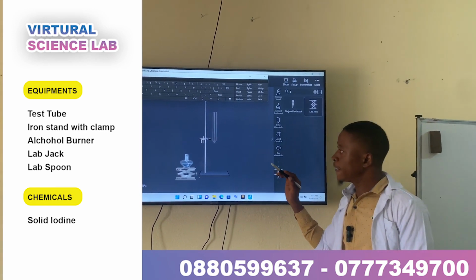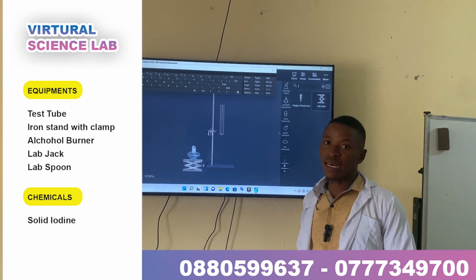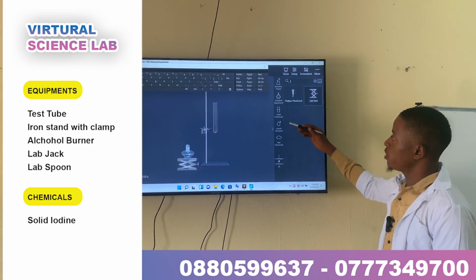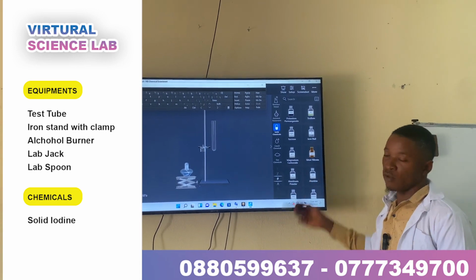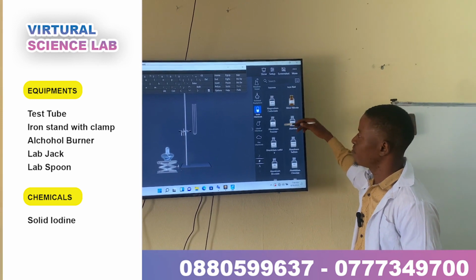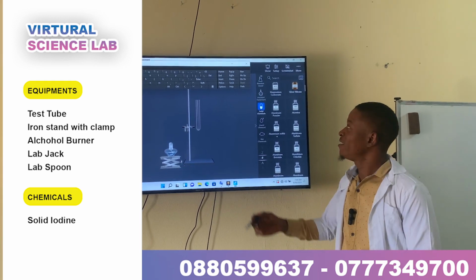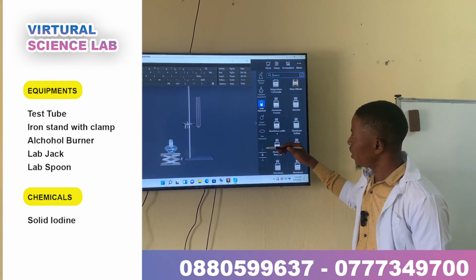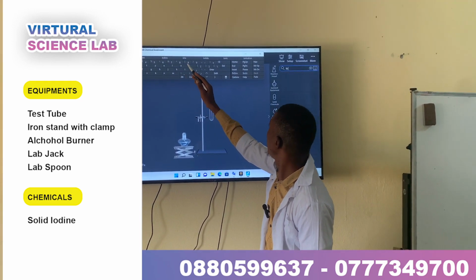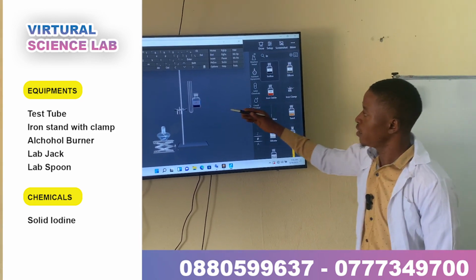Set. Then do not forget you will be needing a sample. So we are going to take iodine, solid iodine. So that is a solid chemical. So we get to where we have solid chemicals. So you see they appear, and we don't want to waste our time scrolling to look for iodine. We can simply do what we just did to get our lab jack. So we'll get back to our search menu, and then we just type in I-O, it appears. So this is iodine. We click on iodine, it appears.